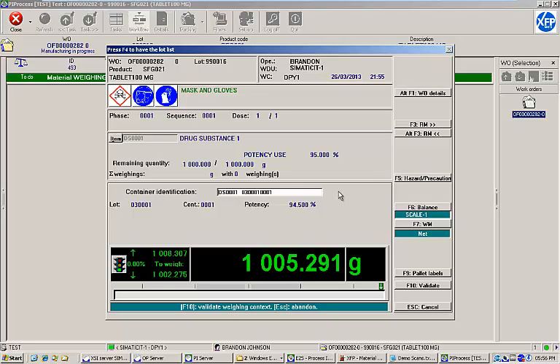It's important to note that the bill of materials calls for 1,000 grams of Drug Substance 1 at 95% potency. Since the lot identified is only at 94.5% potency, the MES has automatically adjusted the required amount and is calling for 1,005.291 grams from the identified container.